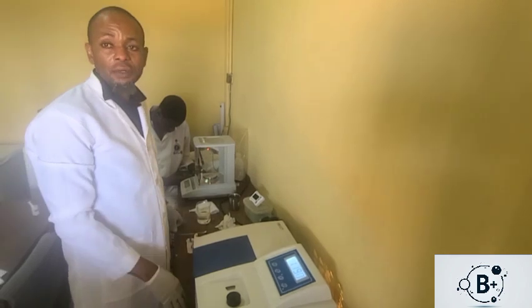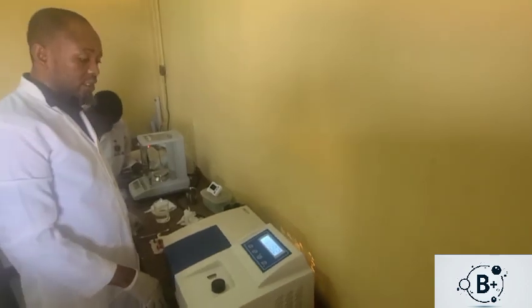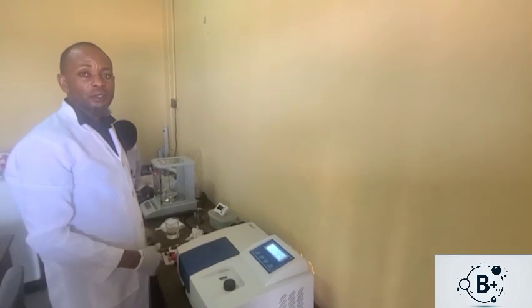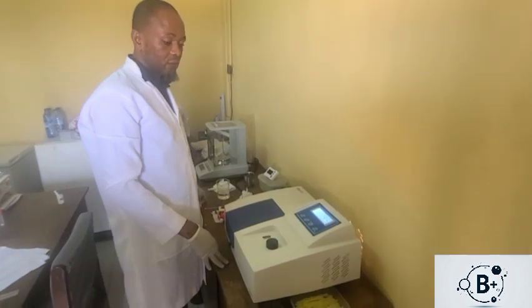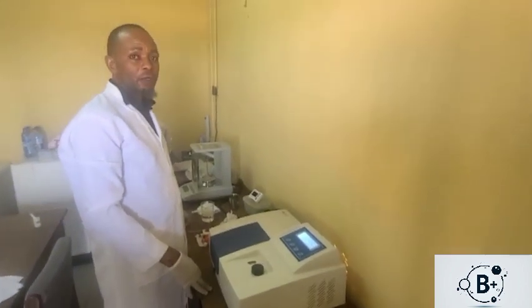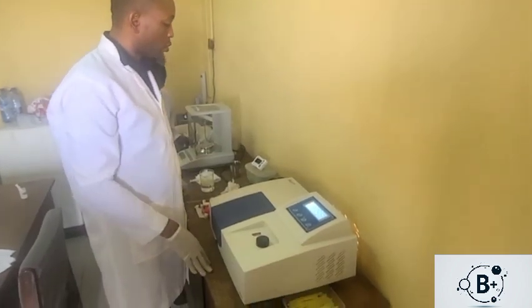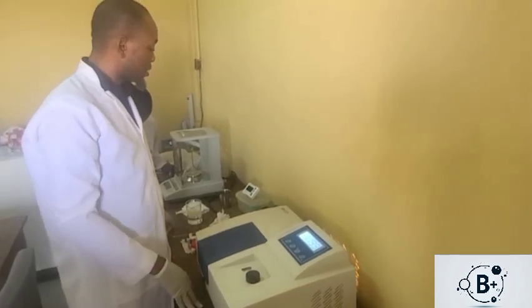We check the average and we see. All right, now we look at it to check for any outliers. Outliers are the extreme values. If the extreme values are not so much, then we can make do with the mean. We calculate the mean, we look at the standard deviation, then we compute our biostatistics.